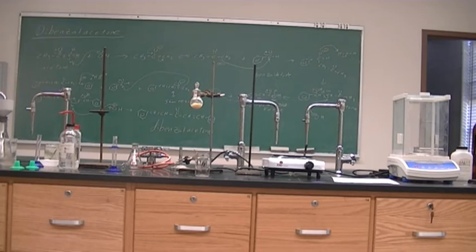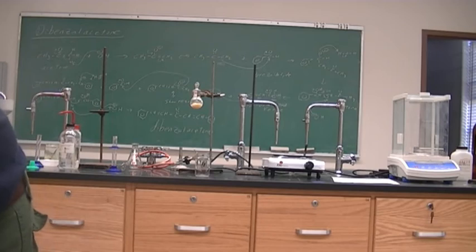Alright, so I'll give you the play-by-play by the melt temp. Alright, Digimelt. We're at 40, no melting. We're at 50, no melting. We're at 60, no melting.